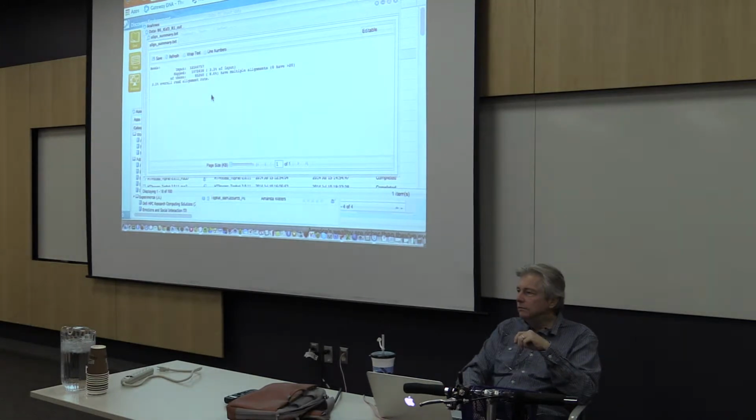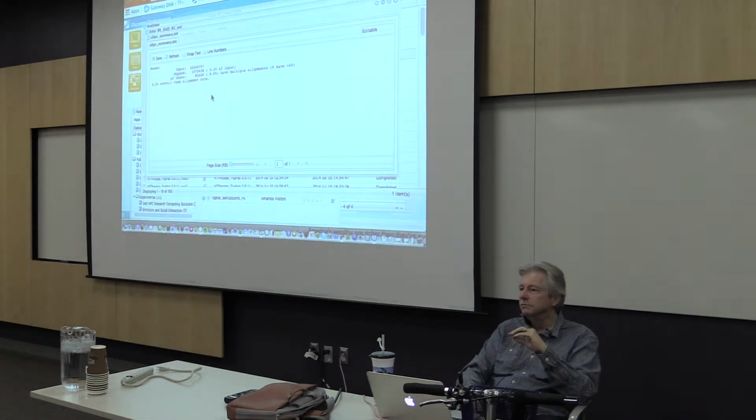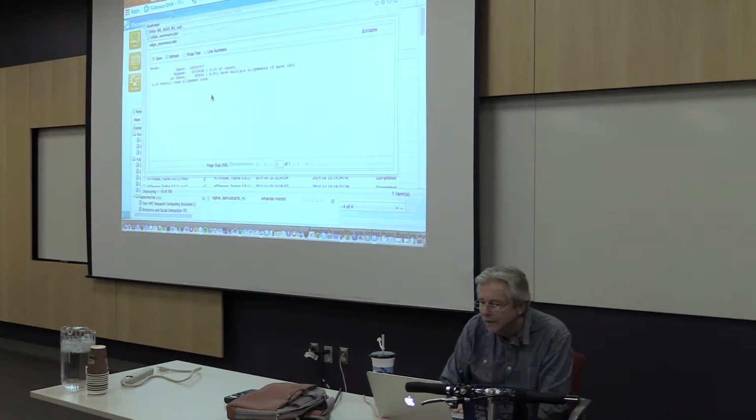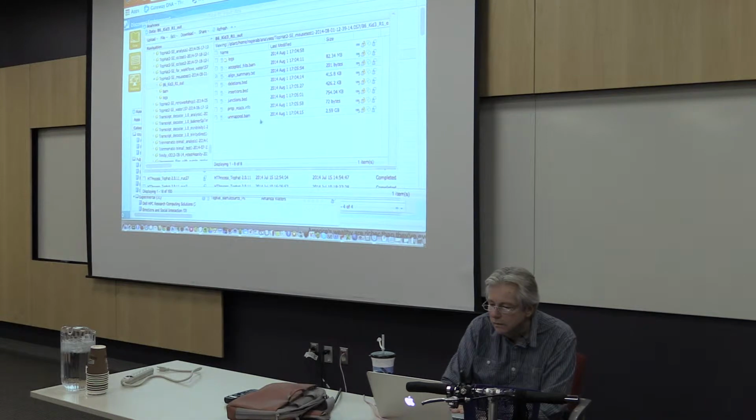But if you got that result, that would tell you you're doing something wrong, or you're reaching across the evolutionary scale or something. A 3.3% overall alignment rate is a red flag.